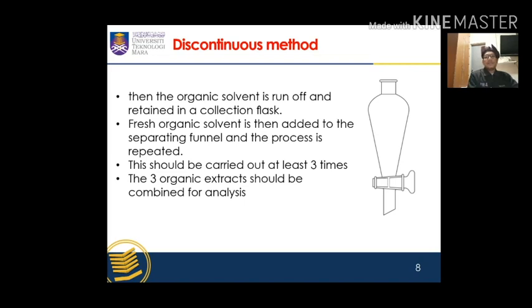After a suitable resting period, the organic solvent is run off and retained in a collection flask. Fresh organic solvent is then added again into the separating funnel, and the process is repeated. This should be carried out at least 3 times in total.